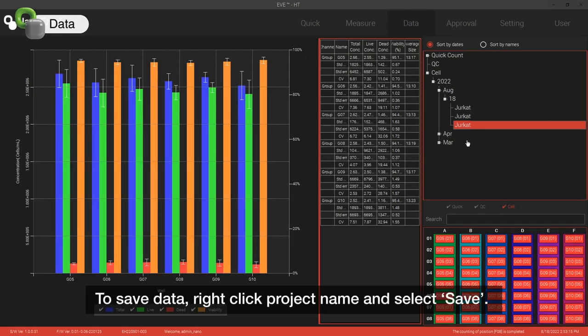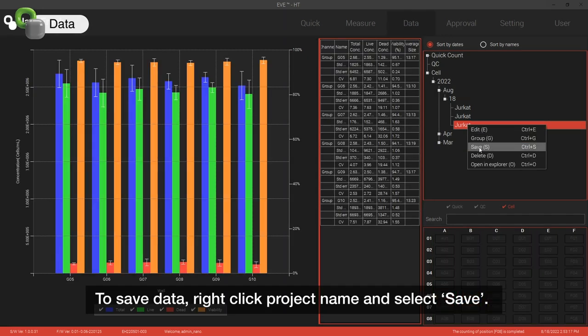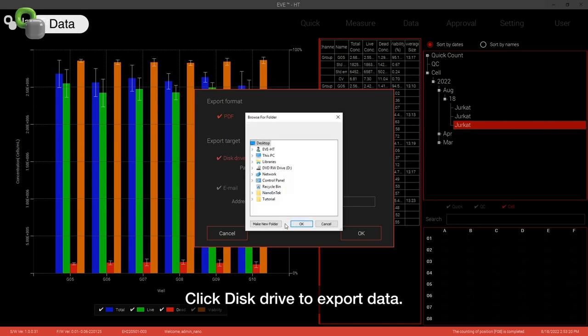To save data, right click Project Name and select Save. Click Disk Drive to export data.